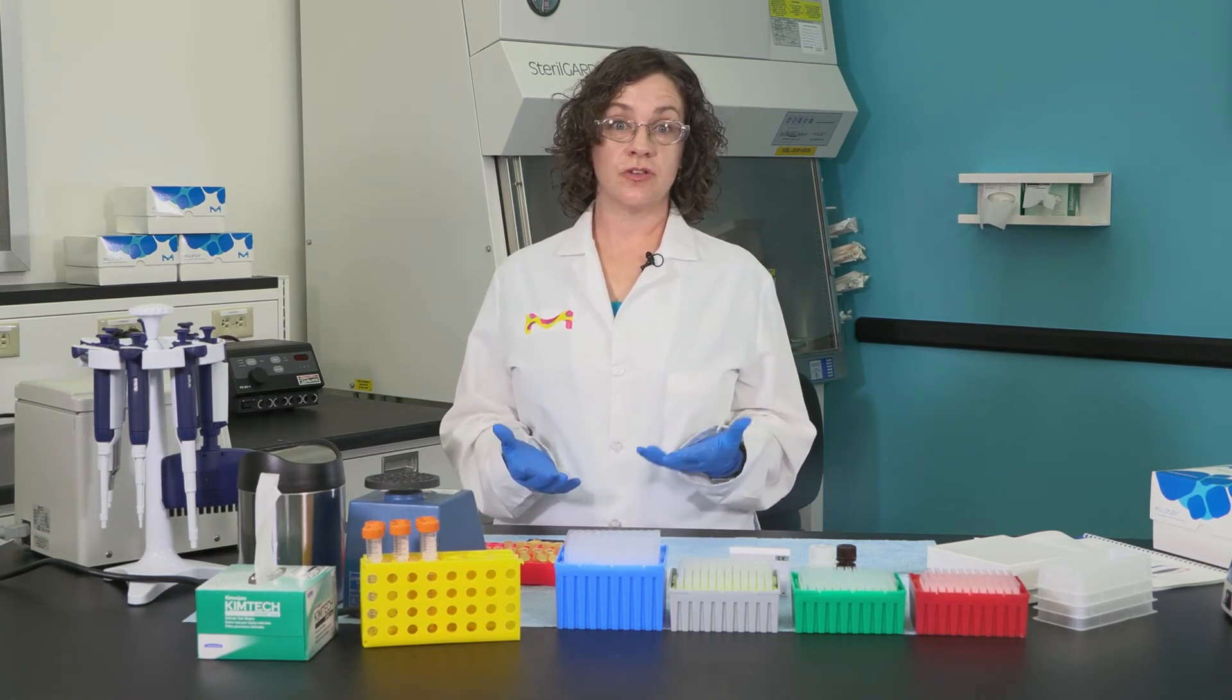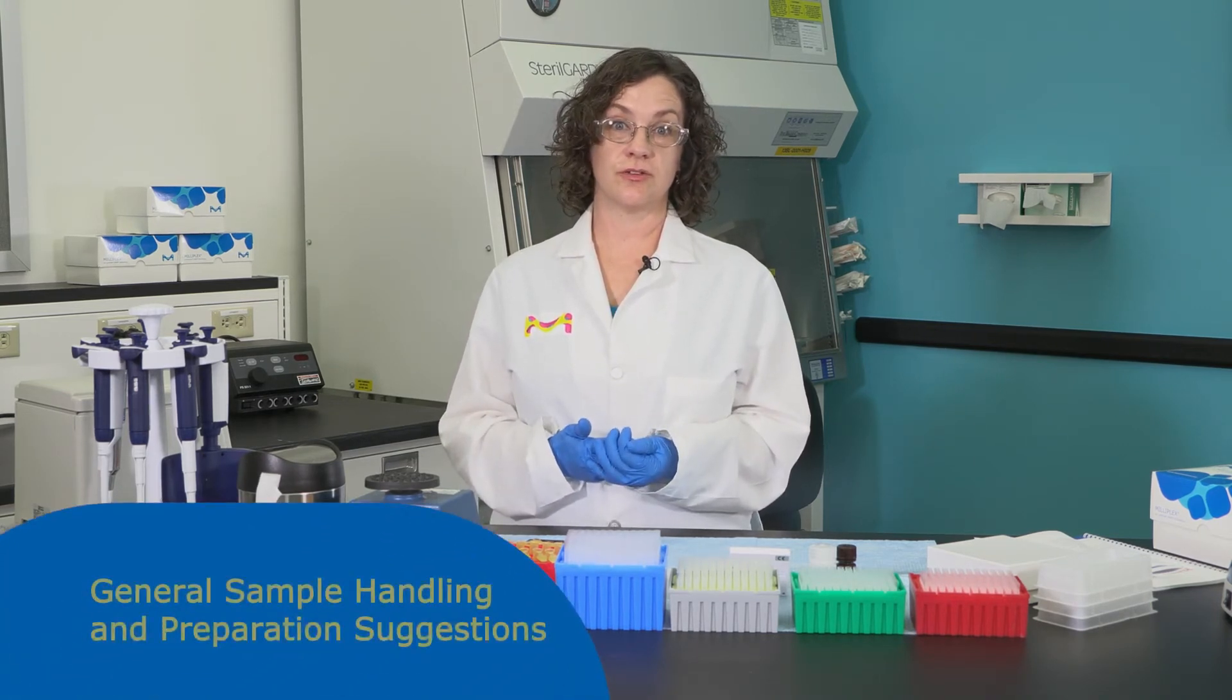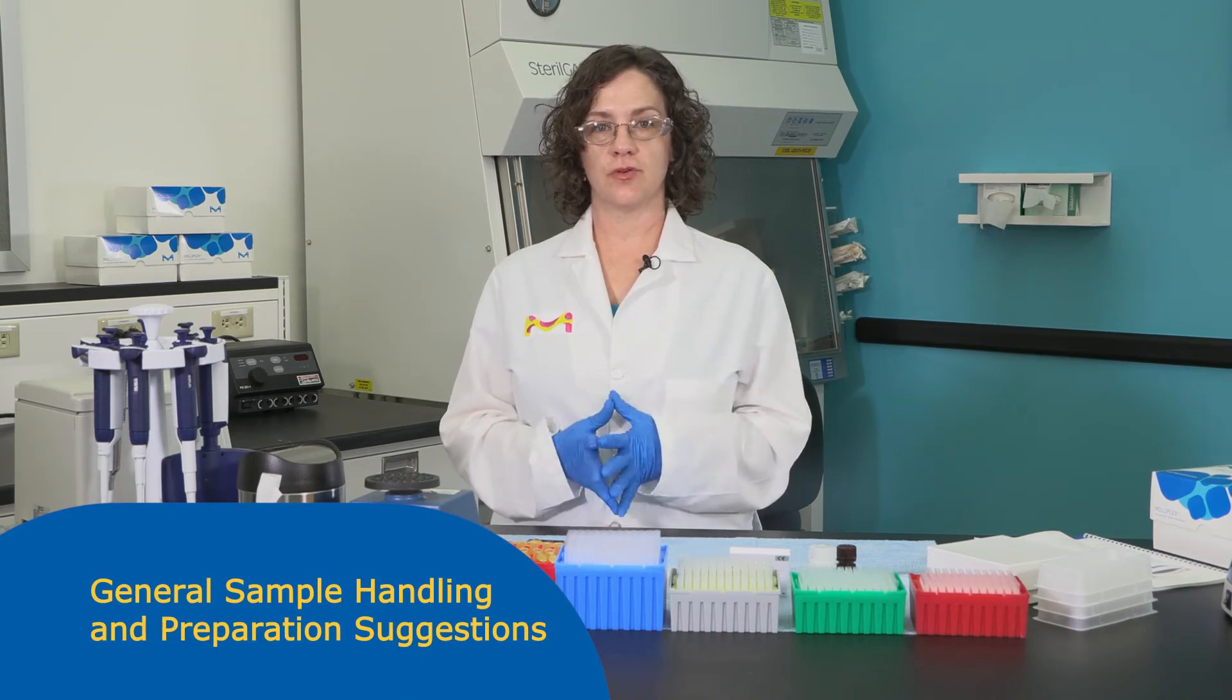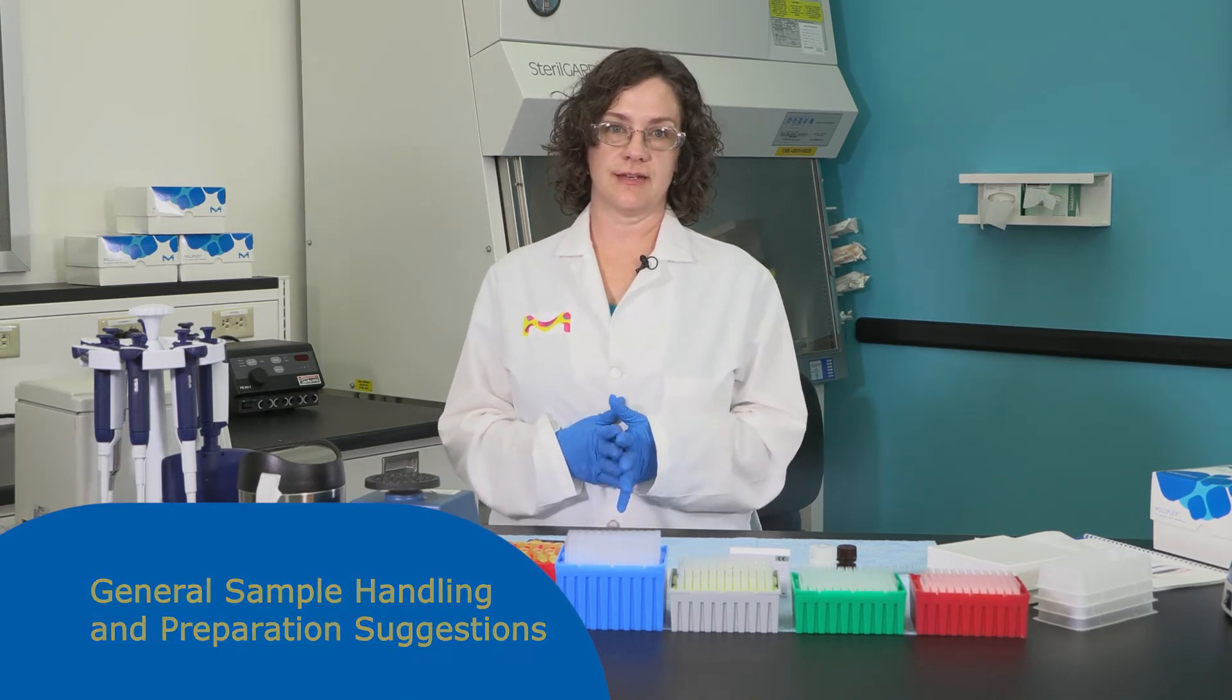Proper sample handling is essential for running immunoassays. From sample collection and storage to sample dilution requirements, each step is critical to achieve the best results for your research. This video will outline best practices for preparing samples for use in milliplex multiplex assays.